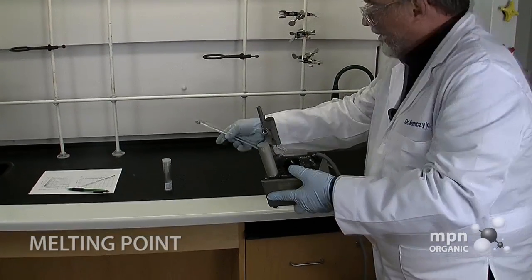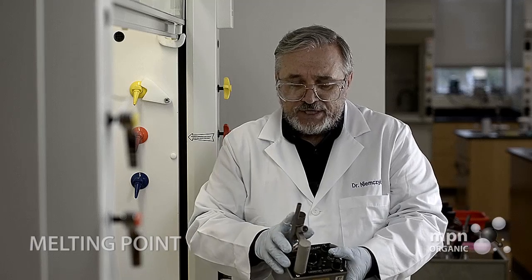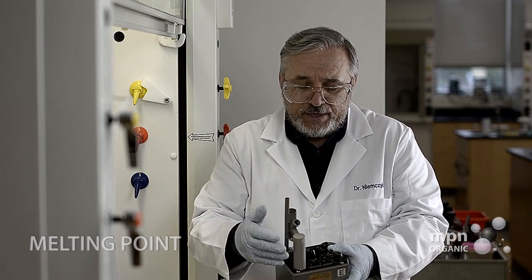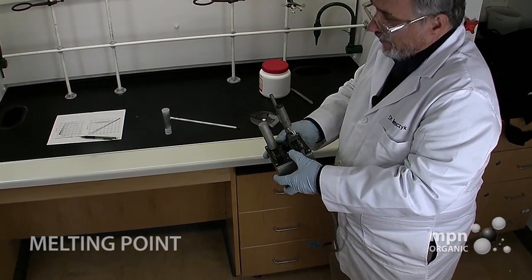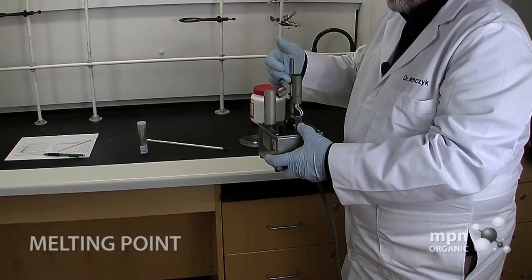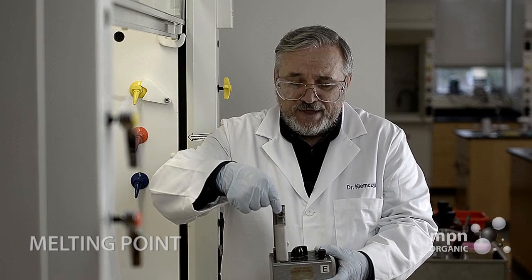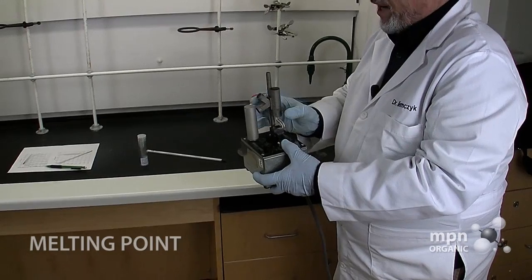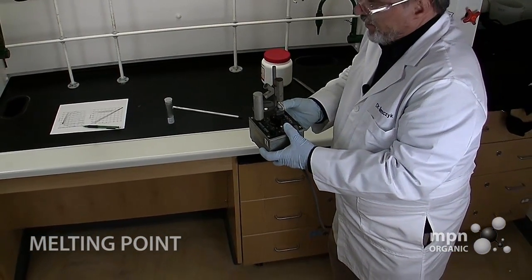Now the Mel-Temp, I should point out, is a Variac which then heats this aluminum bar, and we have a light. You can see the light go on and off here. That's going to illuminate the sample chamber, which is right over here. And we can look through a magnifying glass right on top here that magnifies the bottom of the melting point tube, and there you can tell whether the sample is melting or not.